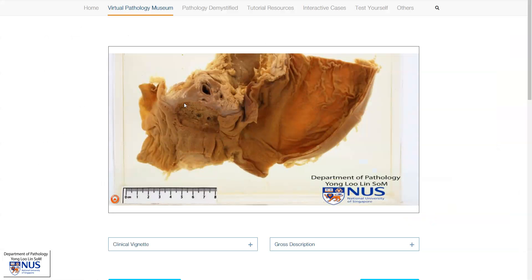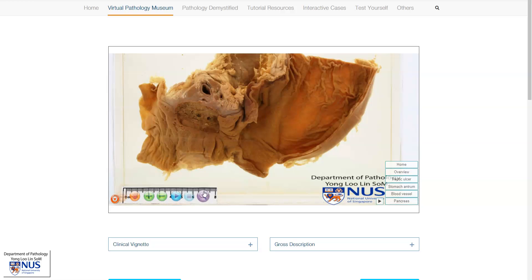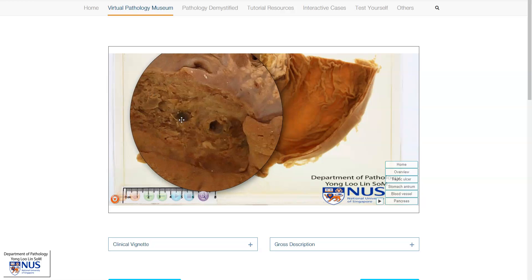This is the second example that I briefly showed. We can see a large punched-out ulcer in the duodenum. This is the gastric antrum. If we look closely within the base of this ulcer, we can see these vascular structures, and therefore this ulcer would have caused very severe gastrointestinal bleeding.